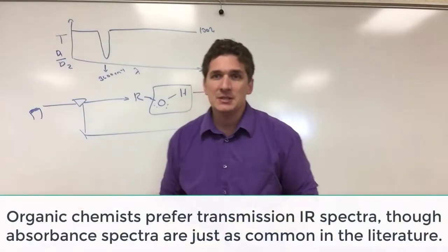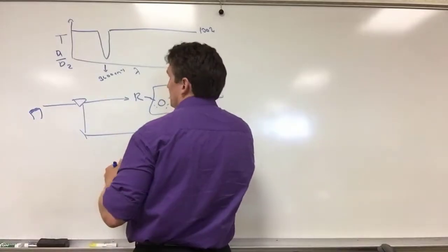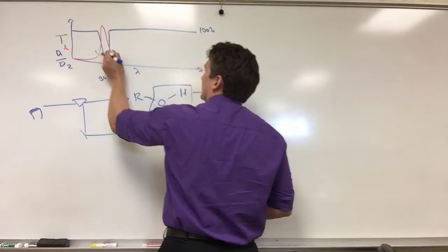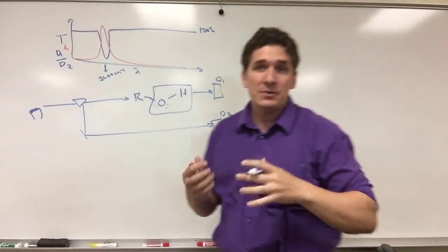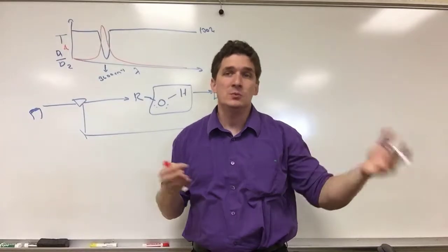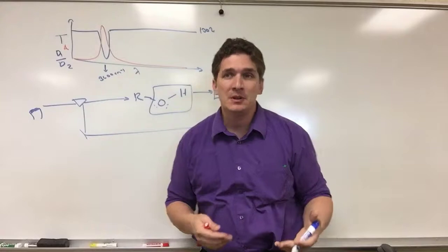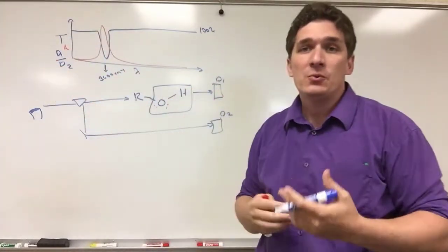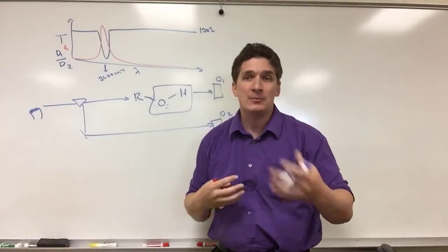But to go to the absorbance, it's just the log. So the associated absorbance spectrum, A here, looks something like this. It's going to take basically an inverse picture. Both will work. Whatever you want to work with, absorbance versus transmission, is fine. Be able to work with both, but understand that if you see a dip in transmission, it's just a spike in absorbance. They both correspond to the molecule having a functional group associated with that particular vibrational mode.